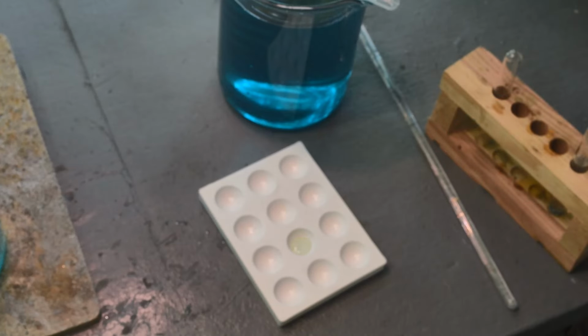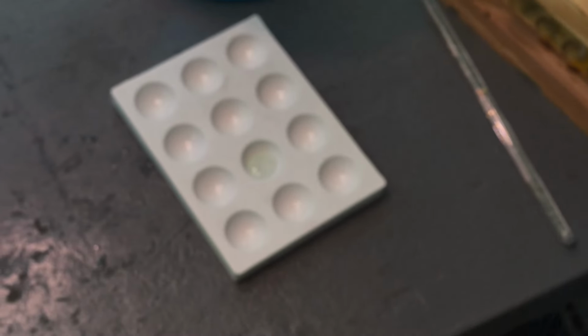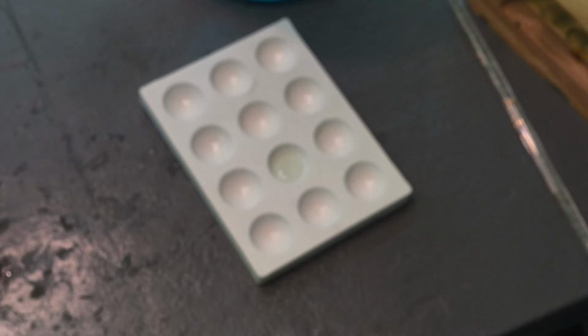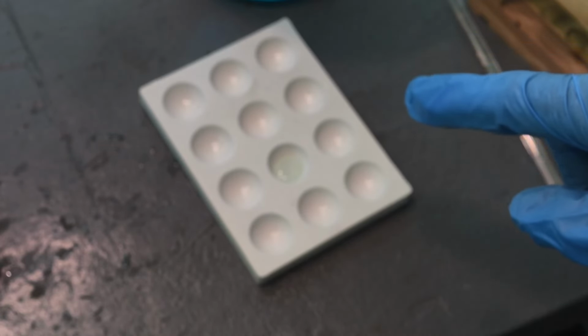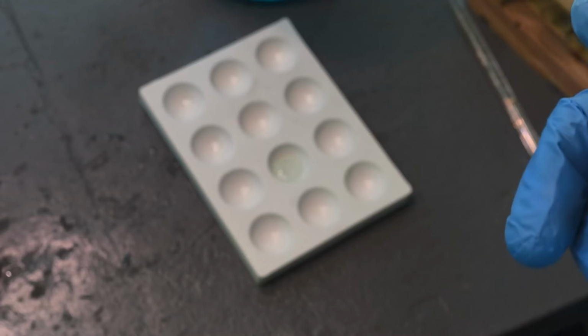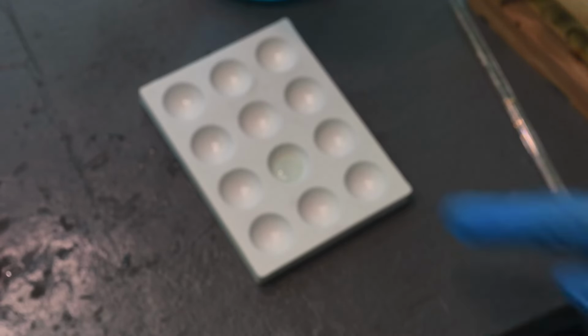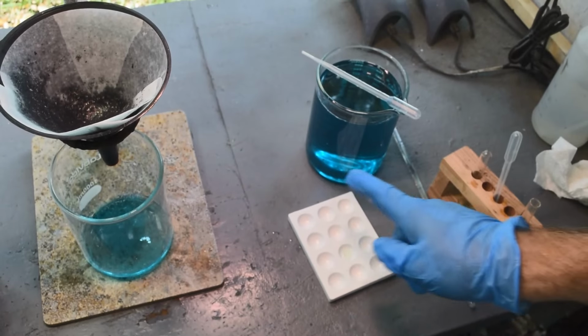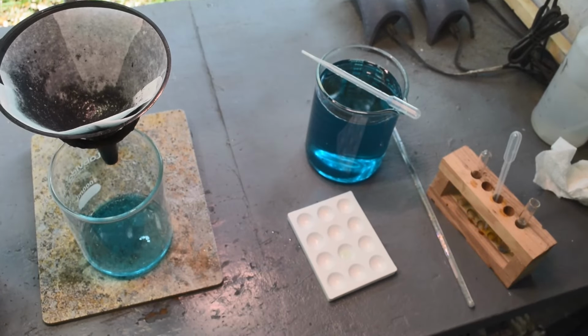Okay, now that was interesting. It initially went kind of orange, and then the colors faded out to a light green. Certainly not as strong as the indication we got before with the palladium that was dissolved in nitric acid. So there's probably traces of palladium in this stuff, not very much. But like I said, I'm going to put these liquids in my stock pot just so I don't throw away any precious metals. I will get them eventually.